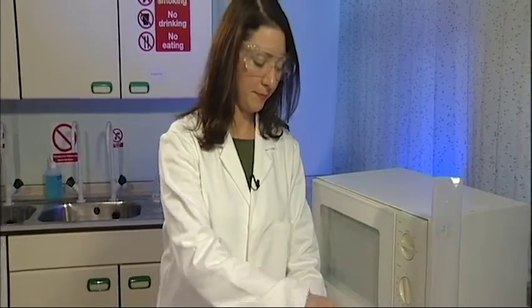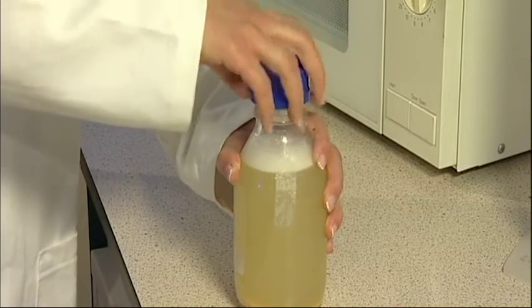Loosen the lid. This is very important. If you don't loosen the lid, it could explode in the microwave.